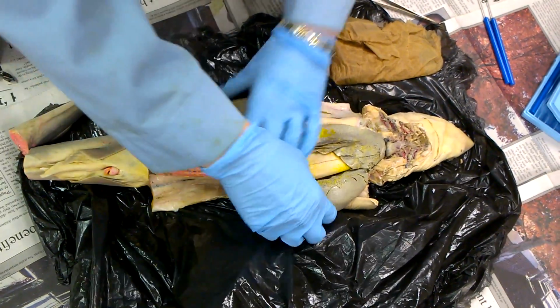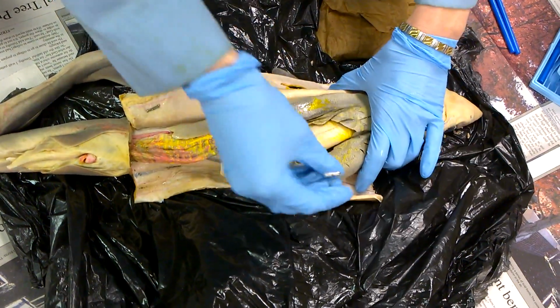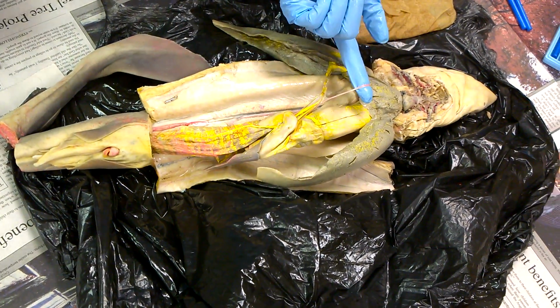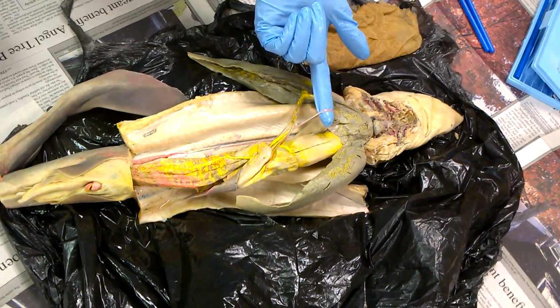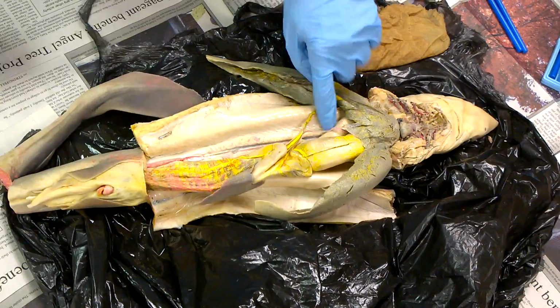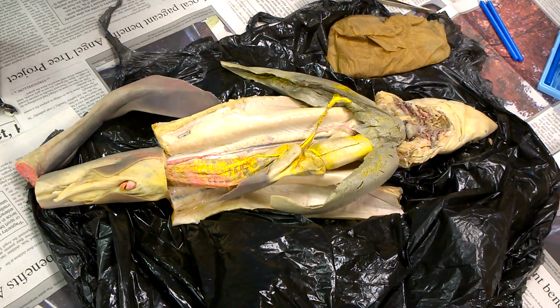We need to label the circulatory system fluid. This is what you'll have. You'll have to know the parts, right? I mean, it could be anything. I could ask you, what is this? I could ask you, where is that taking the blood? I could ask you, what is the flow of the blood from the gills to the stomach, which would involve this. So there are several different ways I could ask you about the circulatory system.